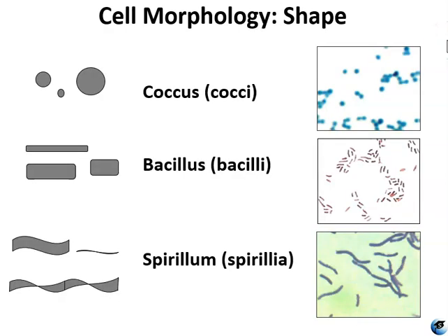It is important to learn what cell morphologies are, and make sure that you are aware that cell morphologies are very different from colony morphologies. Colony morphologies is what we've seen in labs 1 and 2, where you're describing how a colony of genetically identical cells that have all been aggregated to form a mound of cells that you can view with the naked eye. That's a colony morphology. And they have lots of different descriptors like size, color, margin, elevation, all of that stuff.